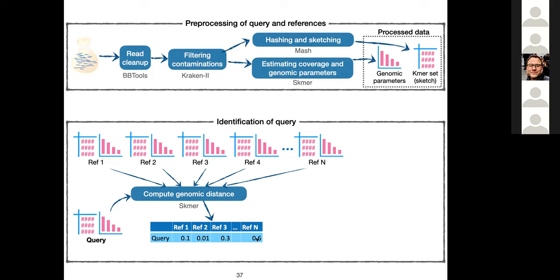Okay, so if you think about the pipeline, once we have this query distances to the references, why don't we think about phylogenetic placement? Let's assume that in addition to your reference genome skims, you also have a tree. However you computed them, maybe you computed the tree from these genome skims, maybe there is a gold standard that you found in the paper. Let's say you have a sort of reference phylogeny.